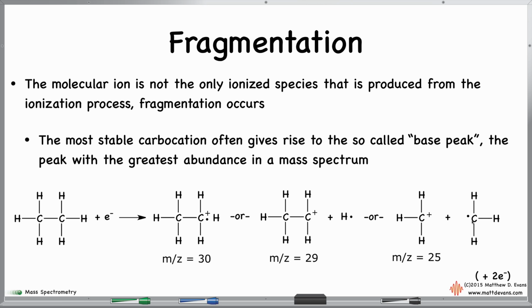This radical right here, we don't care about the atomic mass because it's not accelerated. It doesn't have a charge, so there's no point in looking at this because it doesn't accelerate down the tube, so it just flies out the waste, I suppose. There's like an exhaust port. In every case, what ends up happening is we produce two electrons. So no matter whether we're talking about this, or this, two electrons.